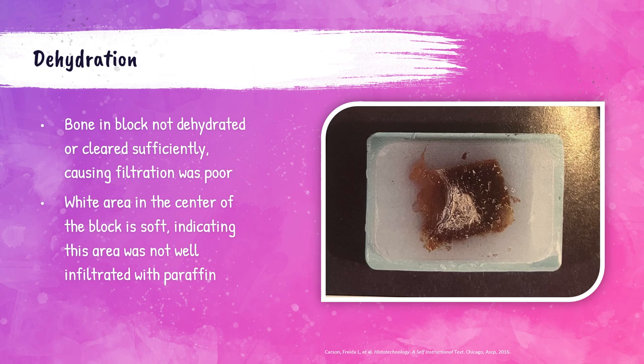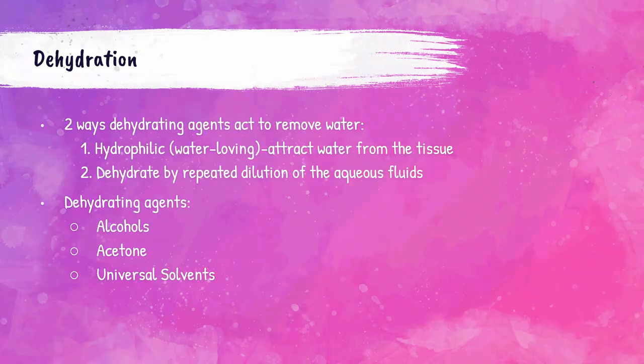This is an example of a bone in a block that was not dehydrated properly, resulting in it not being cleared properly and causing insufficient infiltration. The white area in the center of this block is soft and mushy, meaning it was not properly infiltrated with paraffin.